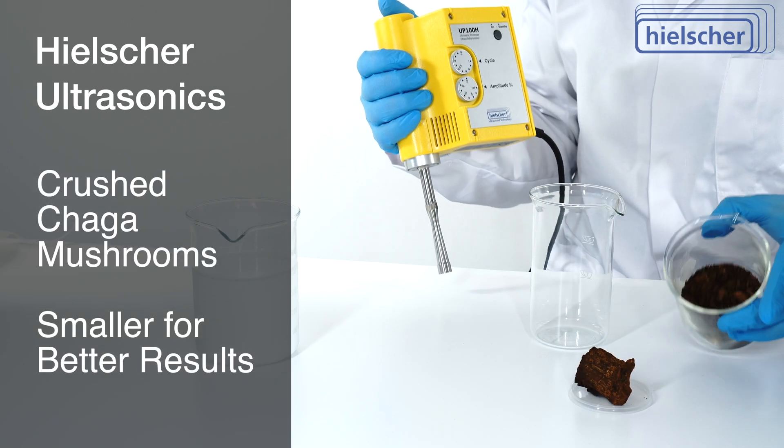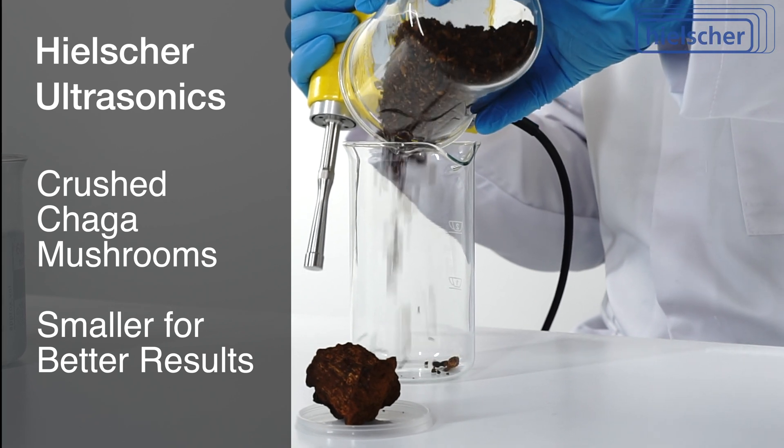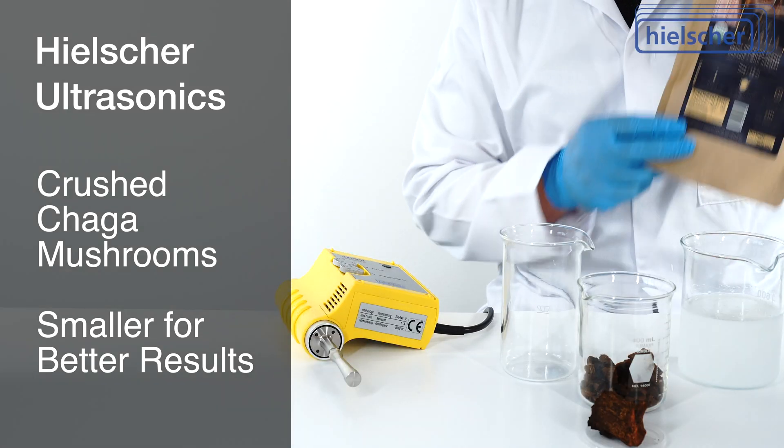For this extraction demonstration we use crushed chaga mushrooms. Crushing increases the surface area available for sonication. Smaller sized particles will give better results. You can use chaga powder if you like.